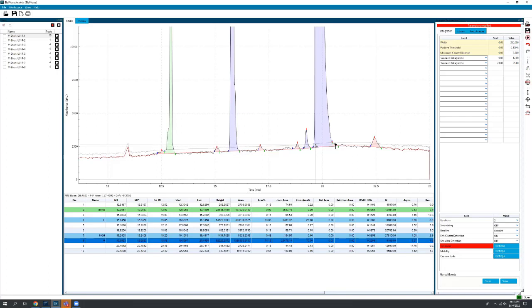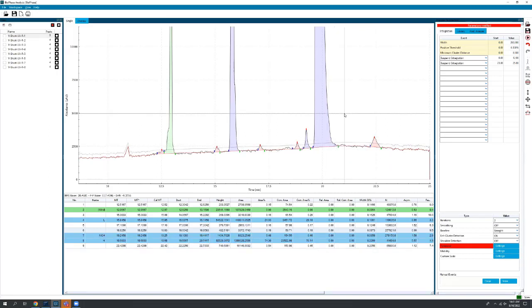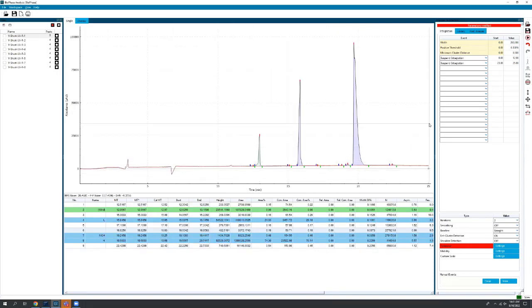But what is really nice in this software is you have what they call these anchors. So if we hold down Control and left click, we get these 2 anchors. We right click, and then we have a lot of things we can do. We can delete peaks, add peaks, merge peaks. We merge those peaks together, and it's all gone.